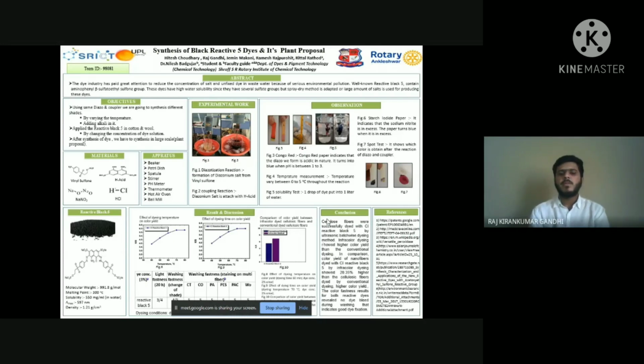Second coupling. OAVS is charged to the MSRL reaction vessel along with water and ice to maintain temperature between 0 to 5 degrees Celsius. Then hydrochloric acid will be added, followed by sodium nitrite powder gradually till the diazotization is complete, which can be confirmed by starch iodide paper. Any excess nitrite will be removed by adding sulfamic acid just before coupling. Keep temperature between 0 to 5 degrees Celsius throughout the diazotization reaction. Further will be continued by Jaimin Makani.